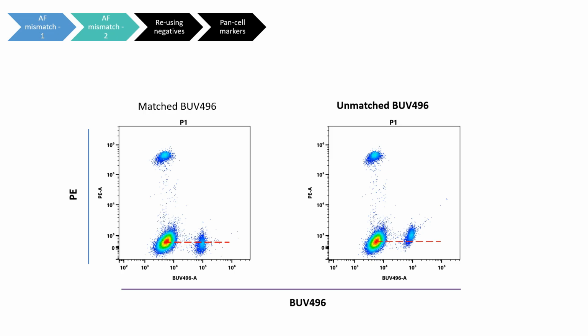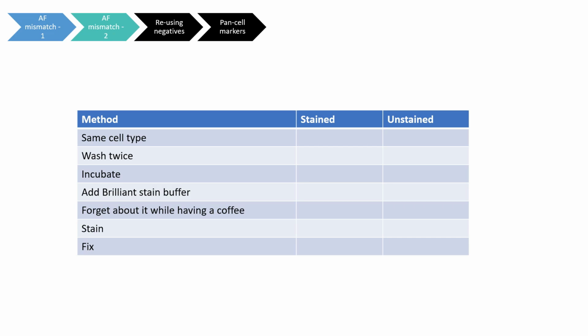It is quite little, however, even a small amount of error created can be exacerbated in larger panels when combined with other errors, or when looking at secondary or tertiary antigens, or when the fluorochrome is very bright. This section can be summarized as follows. Whatever you do to the positive reference must be done to the negative to match it, minus, of course, the stain itself.